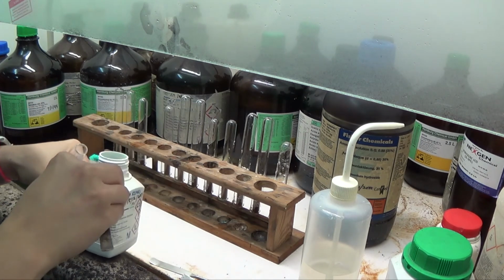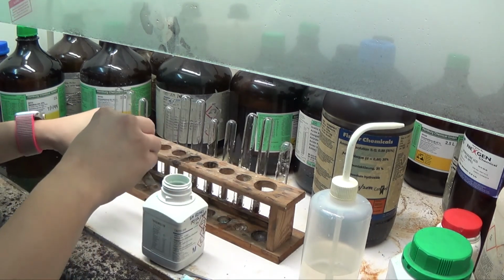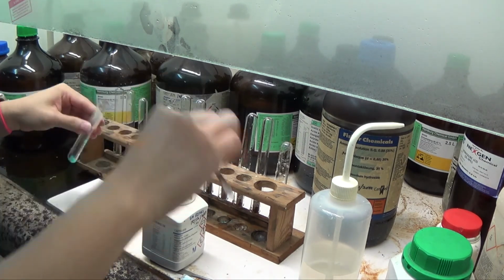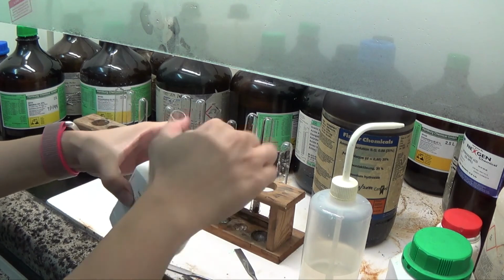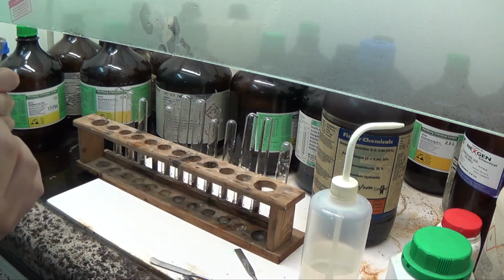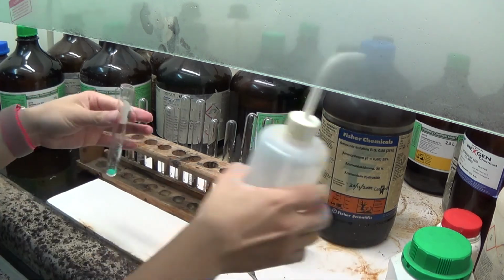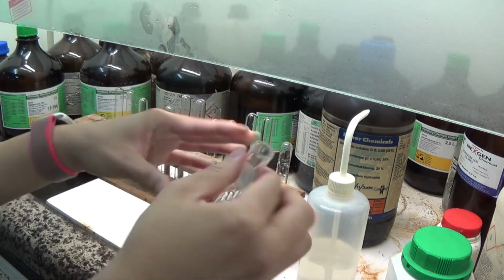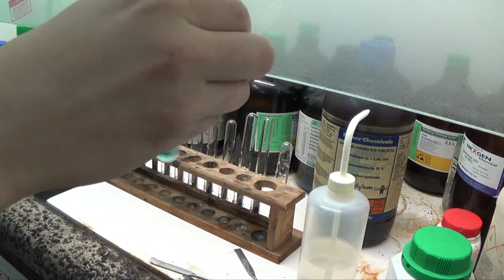So this is copper 2 chloride. Okay. Oof. A bit disgusting there.